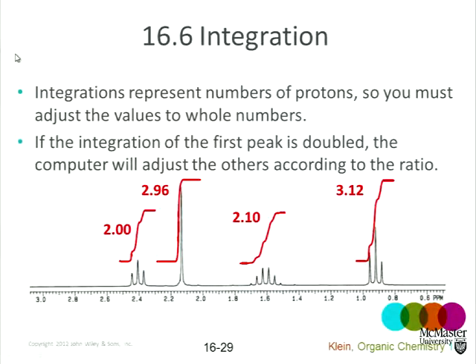So we've now got the number of carbons, the number of hydrogens. Suppose we've done the mass spec. We know the molecular weight. And all of a sudden we can get a molecular formula, right? Because now we know the number of carbons, the number of hydrogens, the total of all those carbon and hydrogen units of weight, and the actual molecular weight.